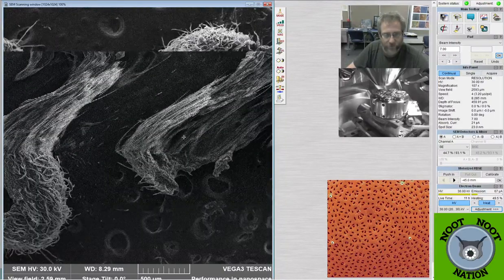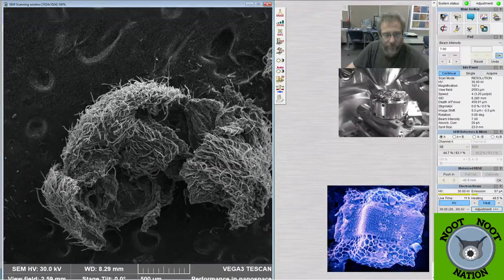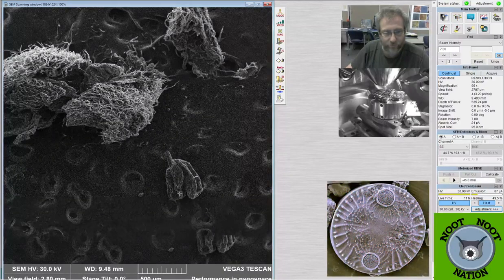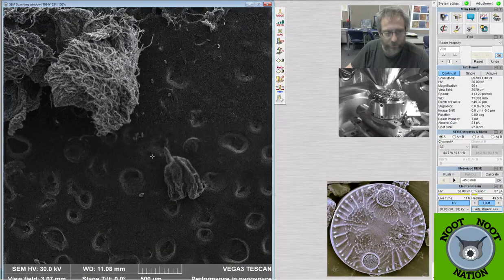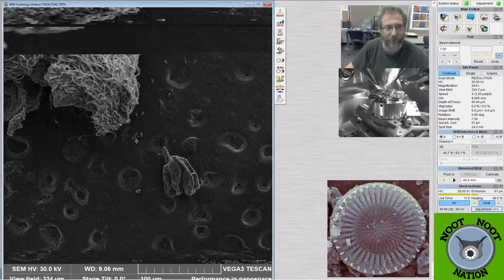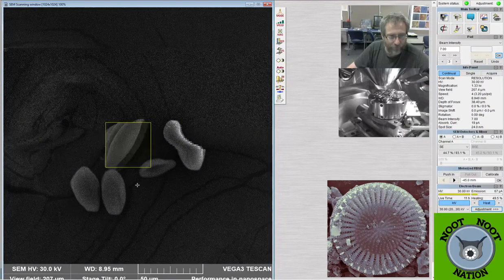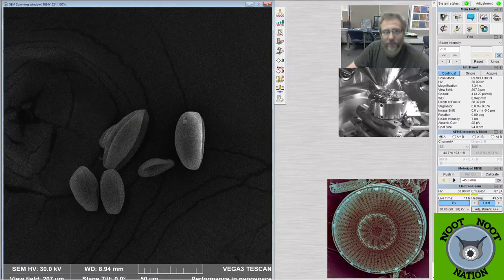And I don't know if this is the locust or if this is the oak, but these are the parts that birds usually eat when they eat flowers from trees. And I see some pollen down here anyway. Oops, help if I stop turning the focus knob and start turning the magnification knob. Yeah, so I suspect that regardless of whether I got the right part, that's probably the right pollen for this tree, because there's a bunch of it here.